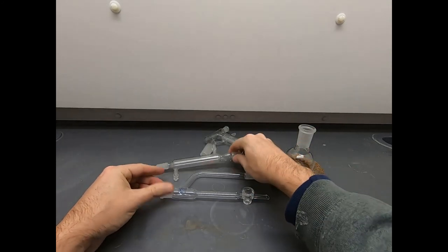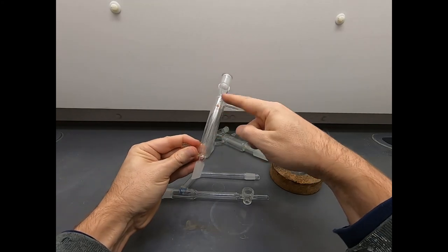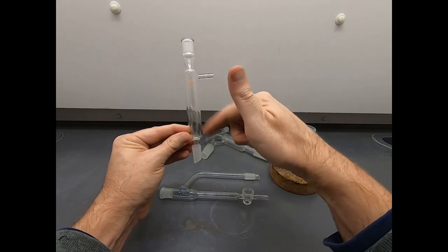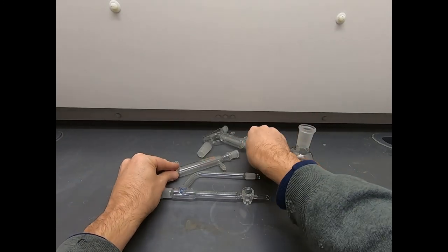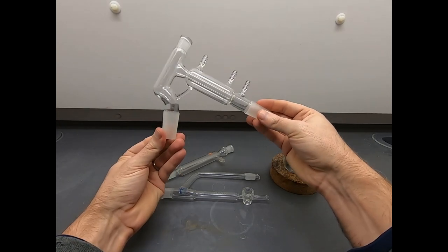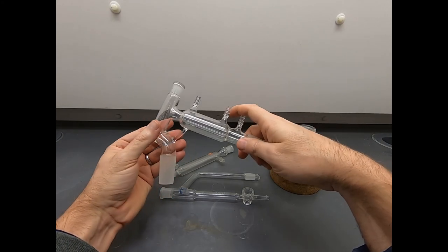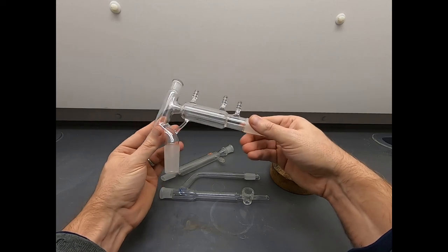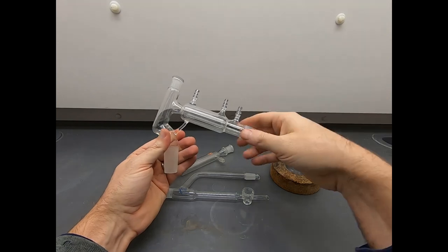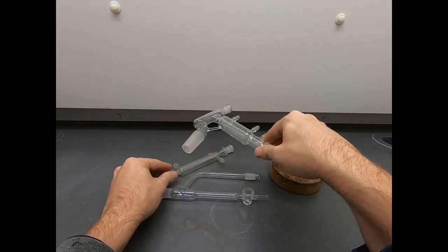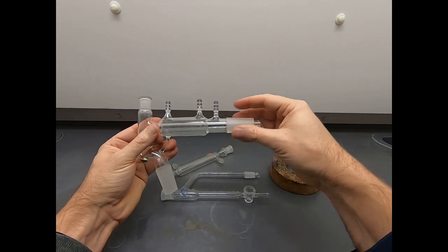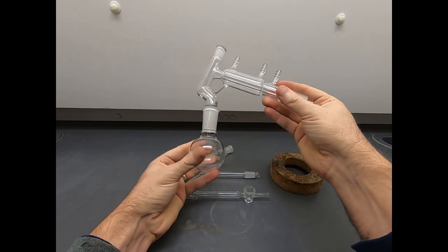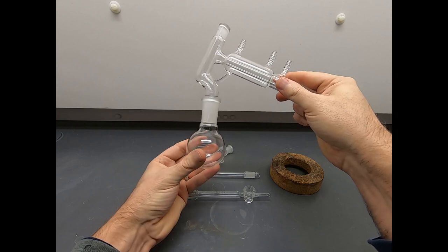Now in the middle here, we have all these weird shaped things. This is something called a Dean Stark trap. This is a condenser, so it has a water jacket in here where you can put water. Water goes in the bottom, comes out the top, and that'll keep things cold if you're generating vapors below, and you want to collect those vapors and return them to the flask. This is called a distillation head. This is a way to purify glassware you'd use to purify a liquid based on distillation. You see a lot of funky shaped stuff in the lab, and it all has a specialized purpose, and when you need to accomplish a certain goal, you reach for one of these types of glassware because they will help you accomplish that goal. Notice that all these examples of glassware, they all have these ground glass joints, and so these are made to fit into things like the round bottom flask that we saw before. They fit together, and you can assemble larger glassware setups by connecting these pieces together.